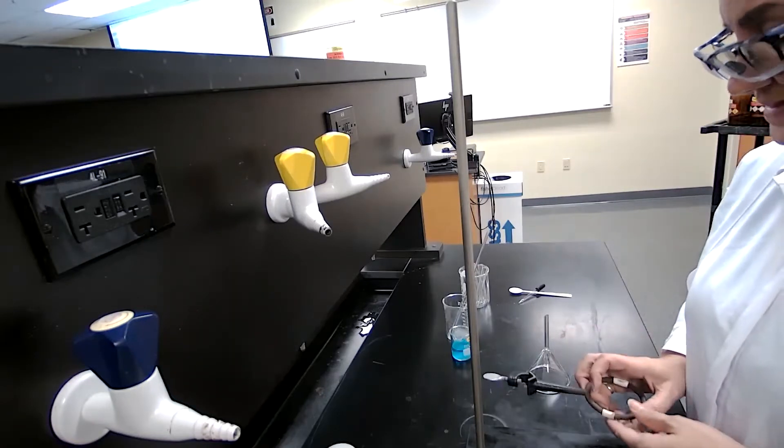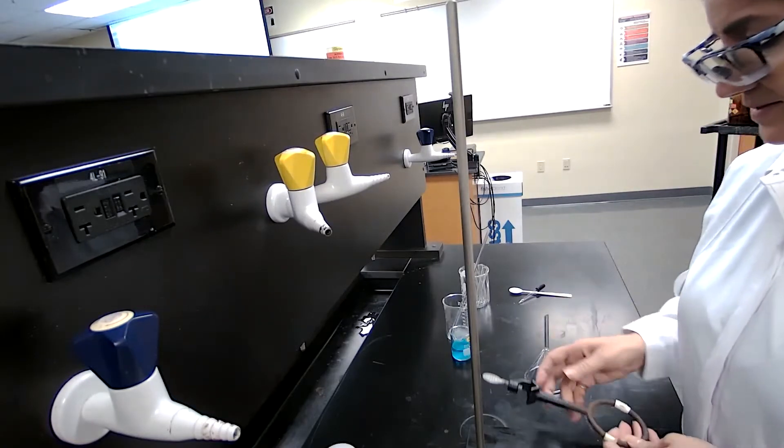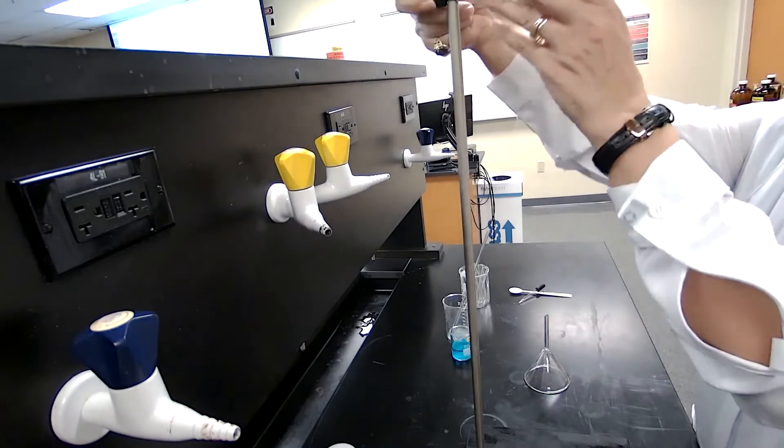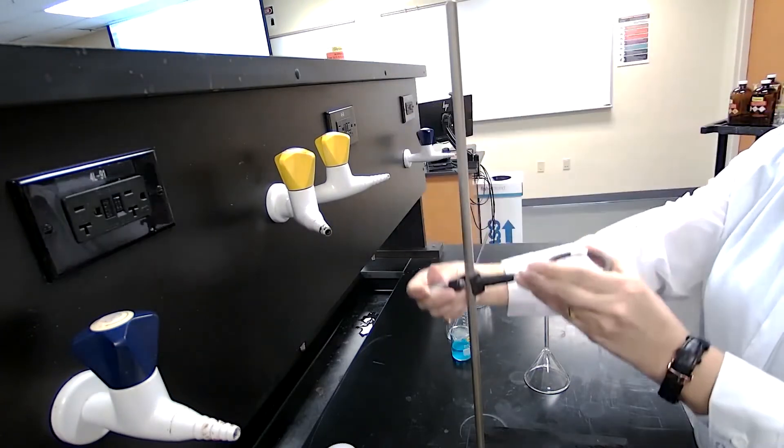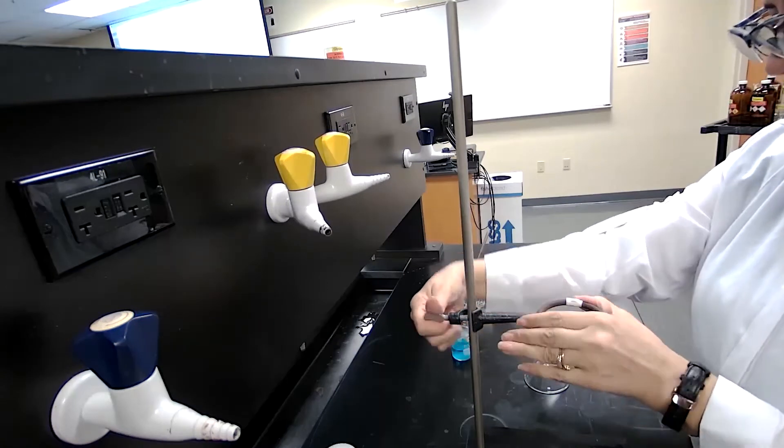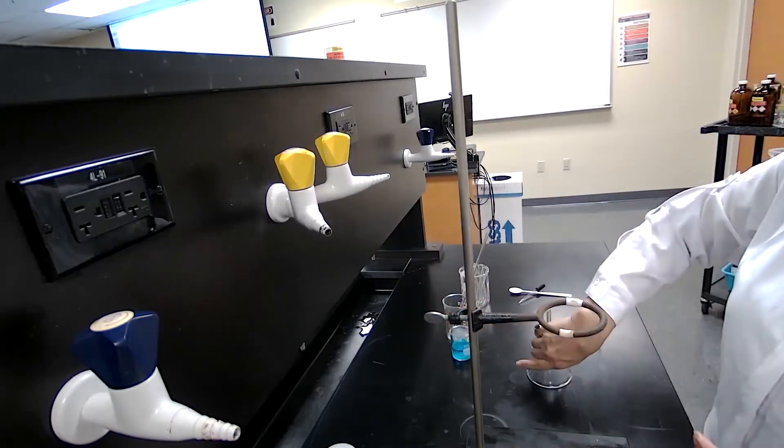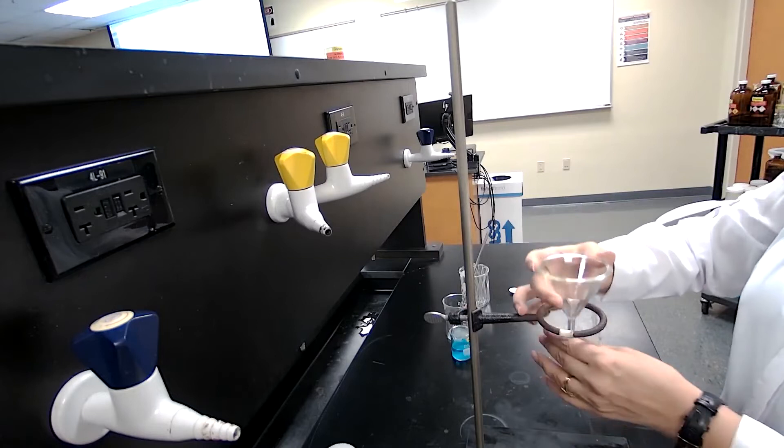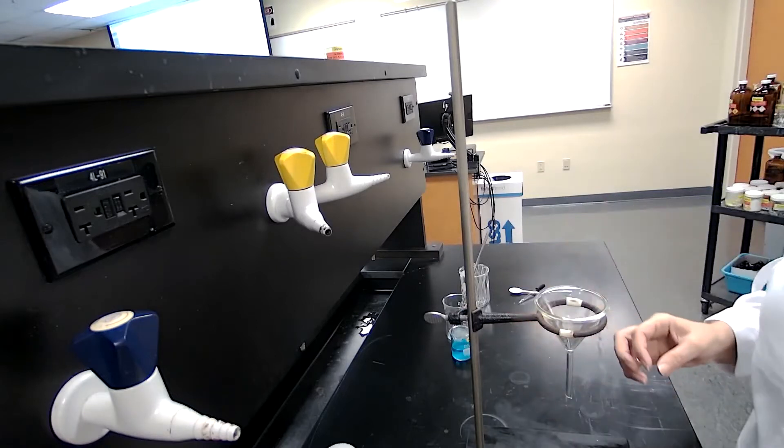For setting up the gravity filtration, we are going to use a small iron ring to attach to a ring stand. This is a support for a glass funnel that we are using for the filtration.